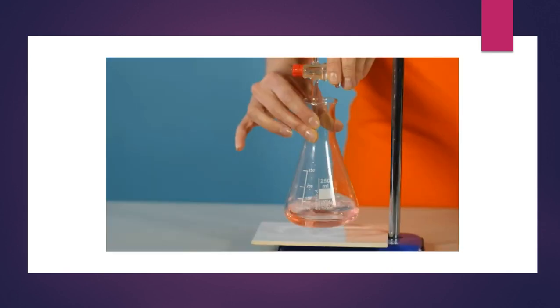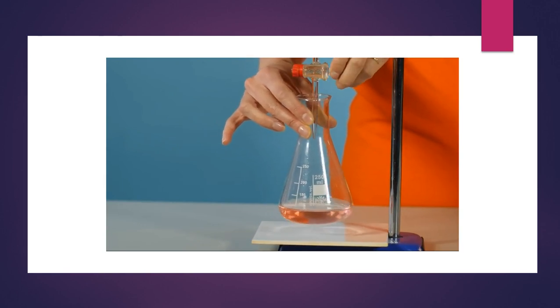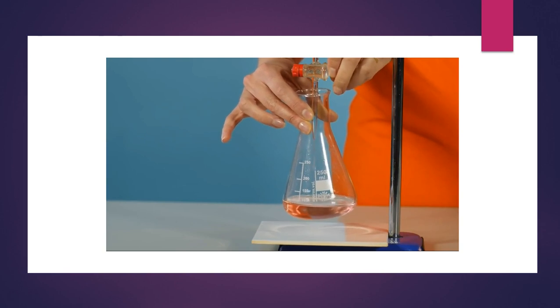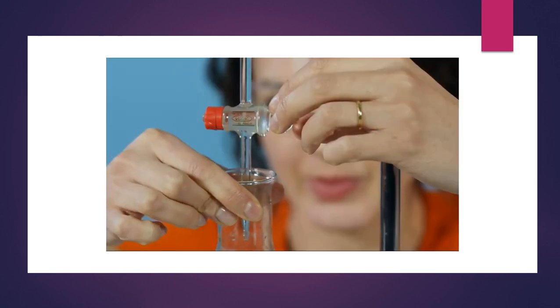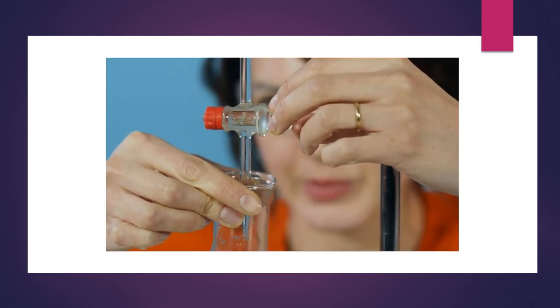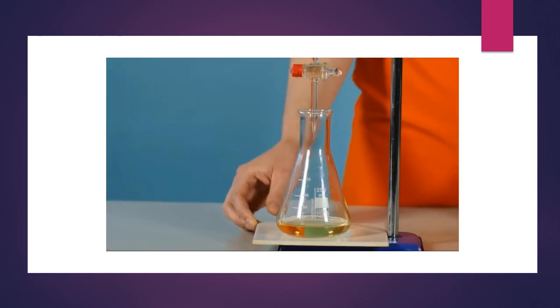Before proceeding with the main experiment, carry out a rough titration. This is to determine roughly how much of the alkaline solution is needed to neutralize the acid and will give us an approximate value of the endpoint. Start by running the sodium carbonate solution quickly from the burette into the conical flask while swirling the contents. When the colour change of the indicator starts to be more persistent, slow down the flow. Then start adding 0.5 cm³ at a time until the endpoint is reached, swirling the flask continuously. Note the burette reading.